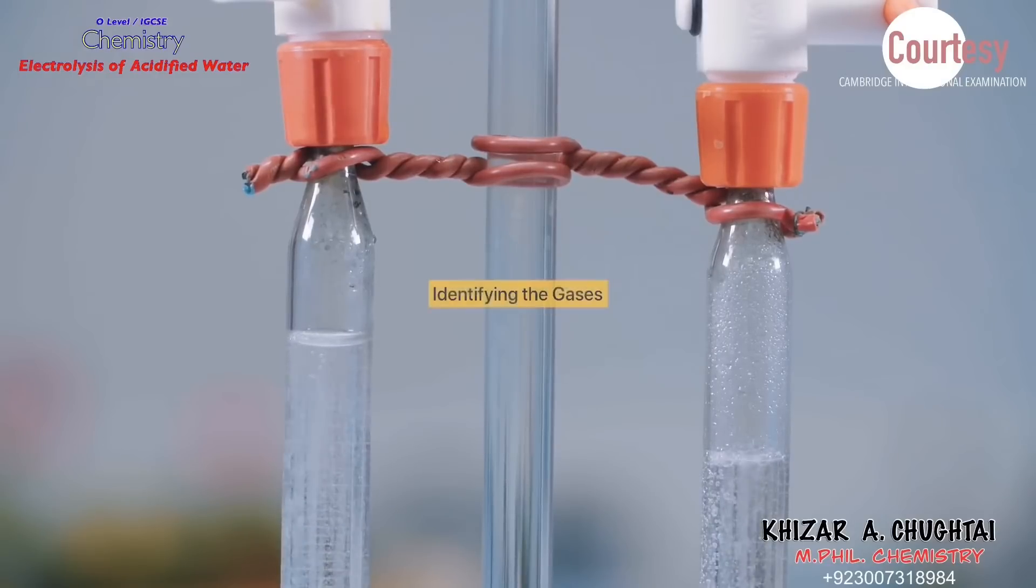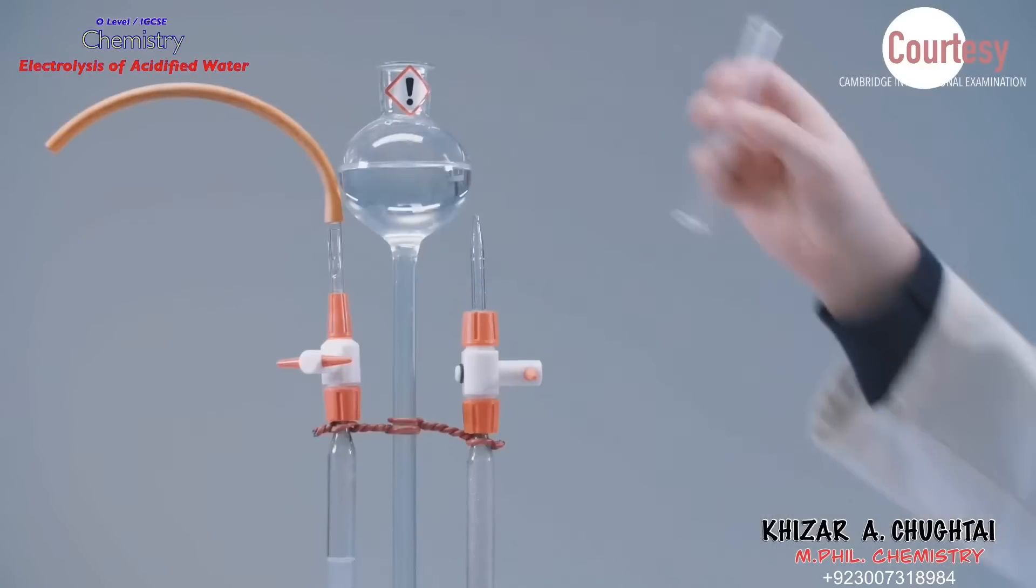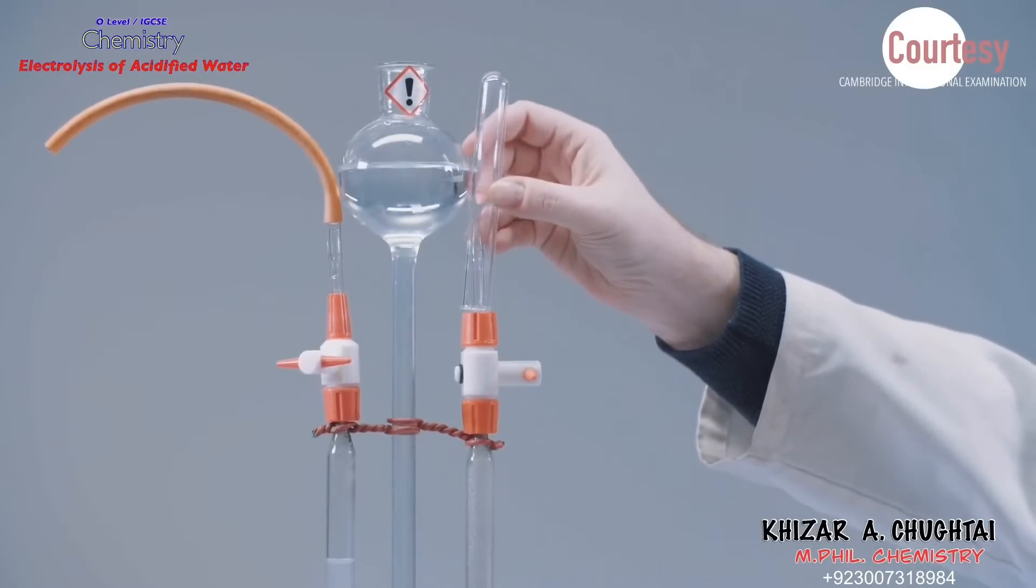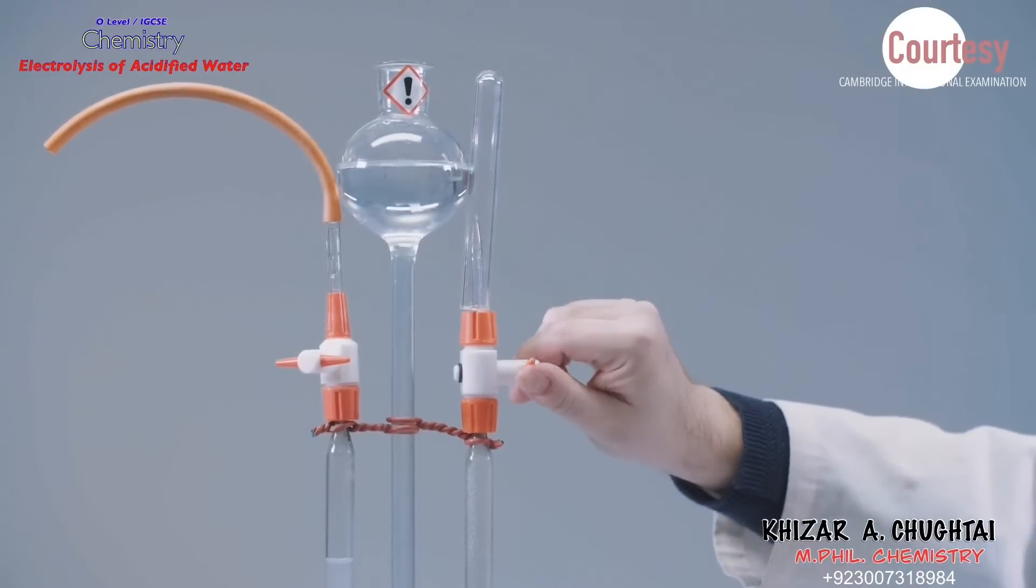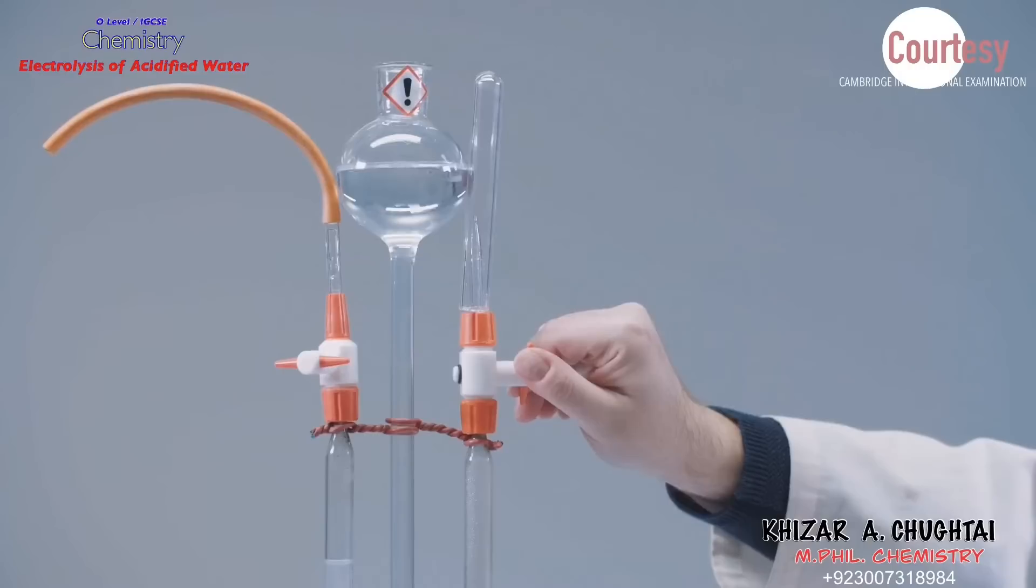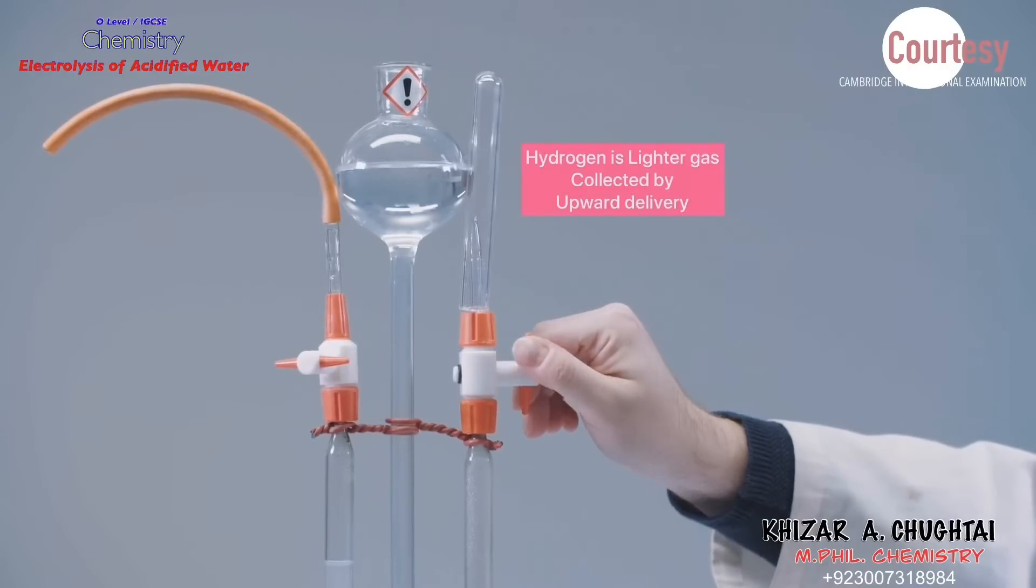The identities of the gases can be confirmed using the qualitative test for hydrogen and oxygen. First place an inverted test tube over the tap at the cathode, as hydrogen is a lighter gas. Tap is opened carefully to capture the hydrogen gas.